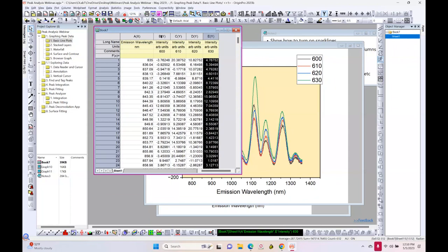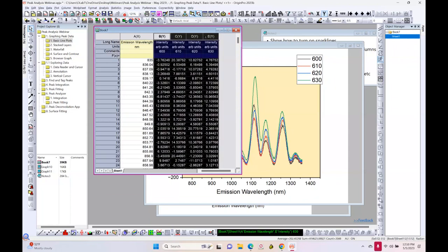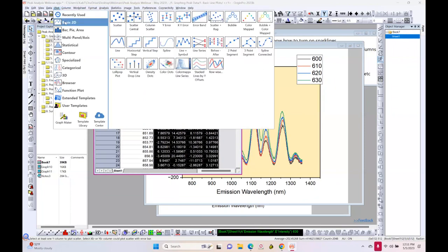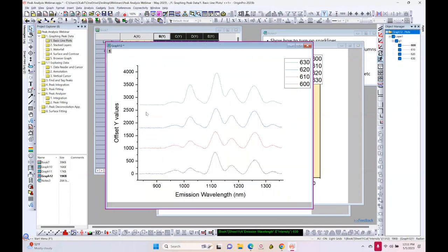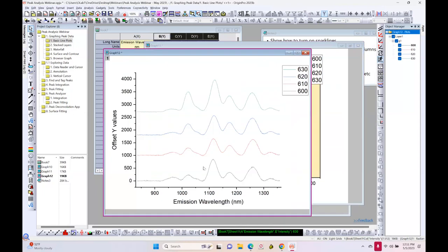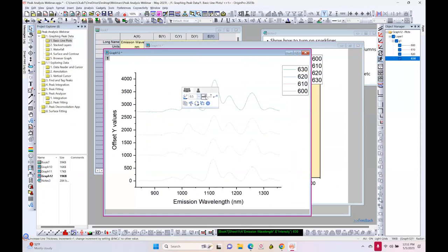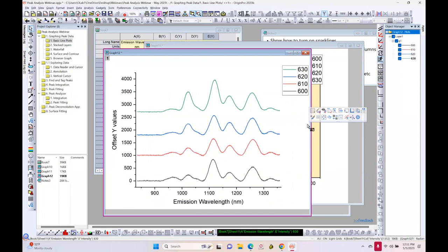Let's go back and see other plot types. Select all four columns and under basic 2D, I'll use the template called stacked lines by Y offset. It's the same data, but each curve has been given an offset so rather than overlapping, you have a better view of your data separated in Y by arbitrary offsets. Depending on your context, you can choose different templates.